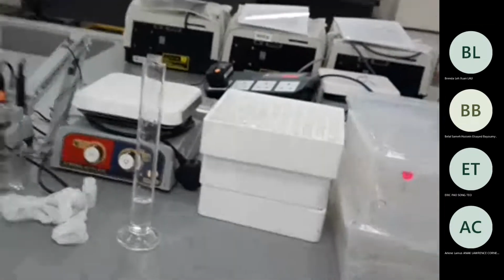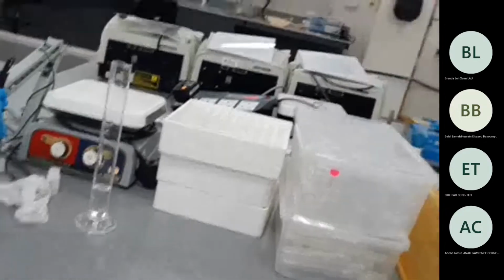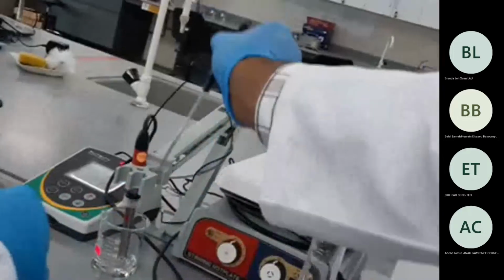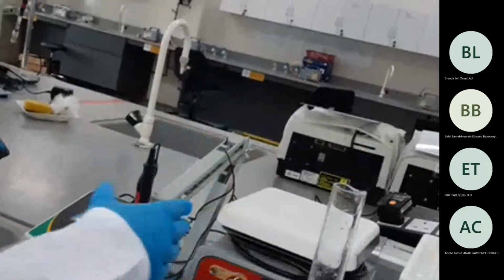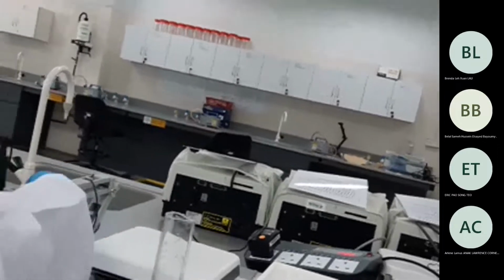Okay, now go for the second one with sodium hydroxide, the same way. But you have to rinse the probes, okay? You have to rinse the probe before you go, otherwise you'll forget later on. All right, so do it.